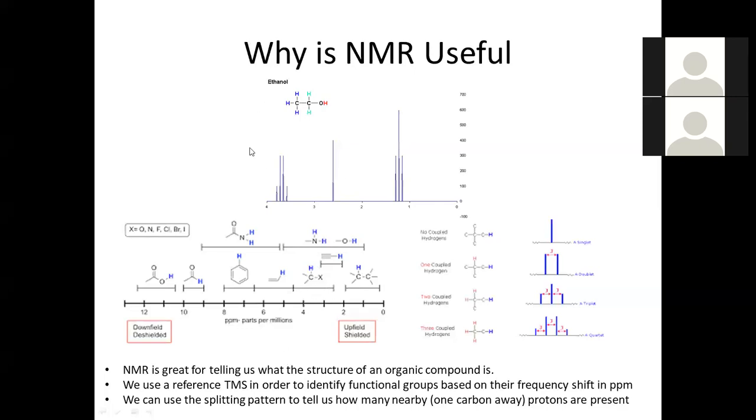So are there any that are easy to explain this way? Well, I think the first thing we can look at is, okay, we expect this to be much more upfield than the others. It could be that this OH isn't. But we usually expect this to be as much upfield as we can. And the one right here by 1 is this peak here. So I'm tempted to assign this peak right away. But there's something else that can help us assign that, and that has to do with the splitting, right?